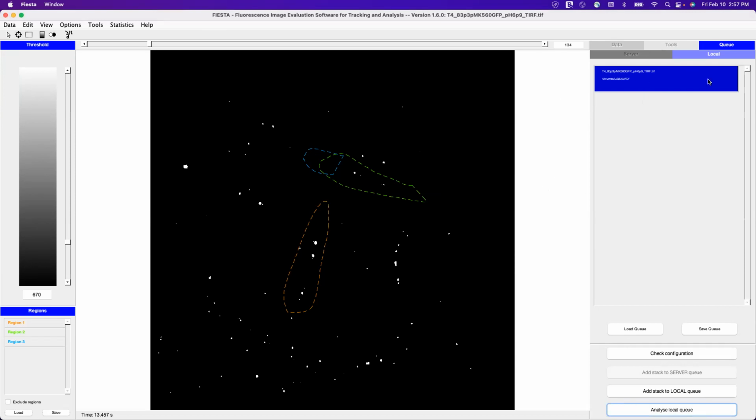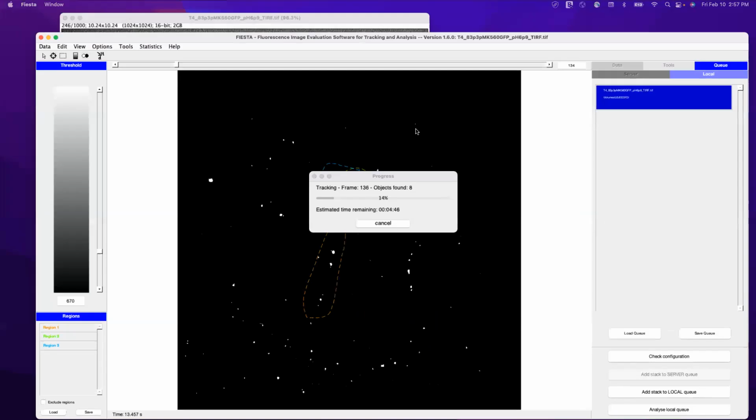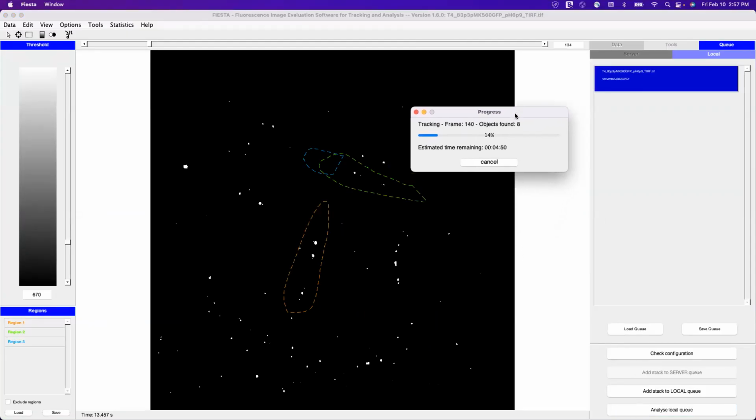Yeah, and also I don't recommend having multiple videos in the queue. Every time I've tried it, it will analyze your first video and then the rest will just be corrupted files. So you're going to have to do one at a time, as terrible as it is. But yeah, that's pretty much it. You got anything else? I think that's it.